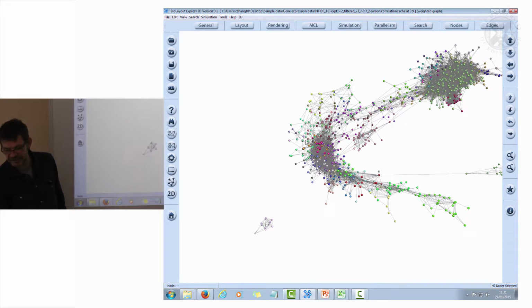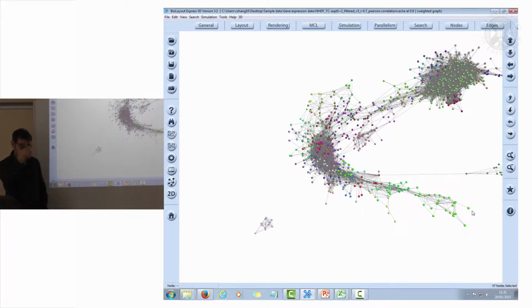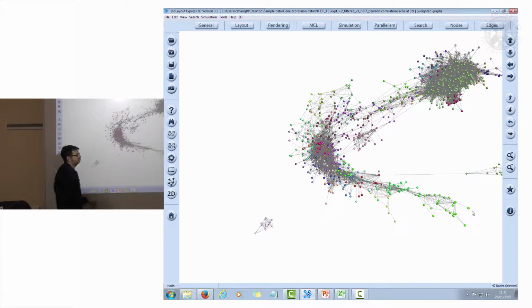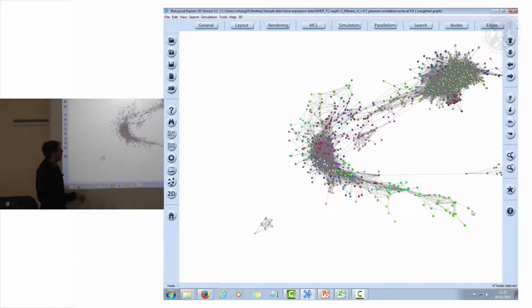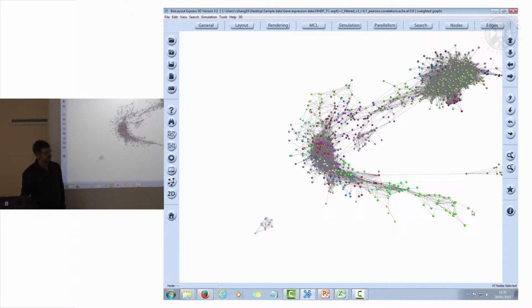Then you get into this phase here, which is G1. These are all the genes which are upregulated as cells grow and prepare to go into division. So you're looking here at a lot of growth factors, a lot of metabolism upregulated here, and essentially this is the growth phase, and these will get turned off. And you notice how there's actually a thin web here. So there's a big burst of transcription.